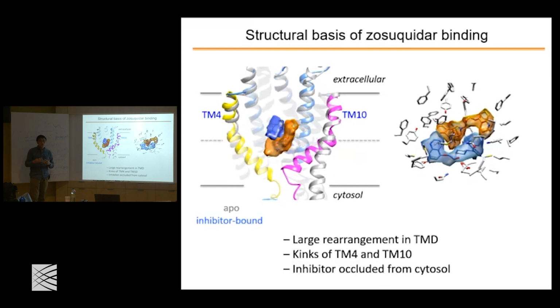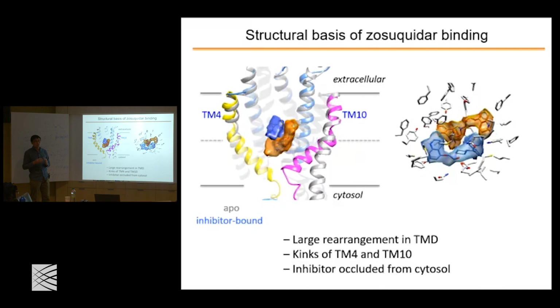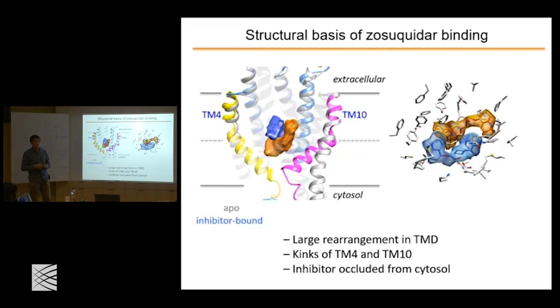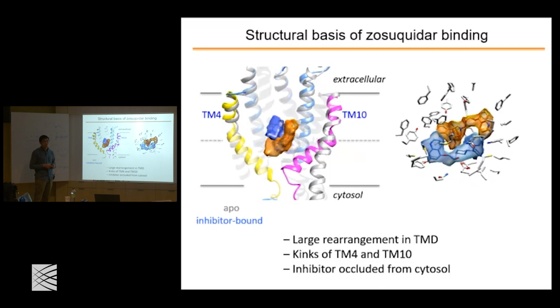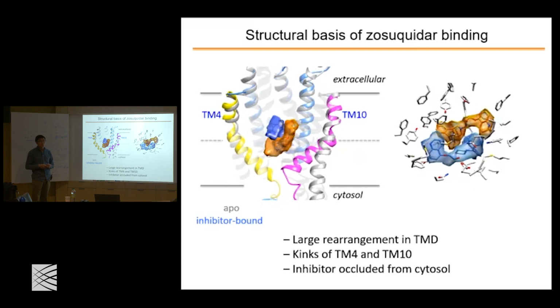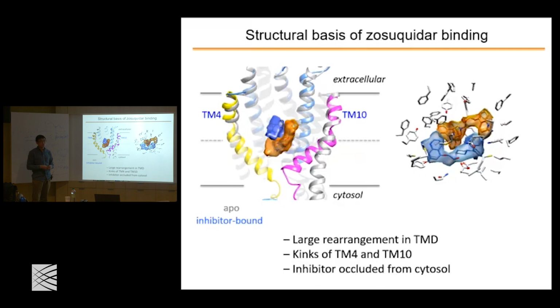So we are really at the beginning of getting a set of structures of, yes? Was it known previously that two copies of the compound are found? No, the stoichiometry was unknown. So it's a new finding. And it's definitely two copies that you're seeing in the structure? Yes. And also, that's not just our group; another group also worked on this and got a very similar structure.